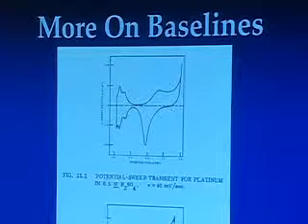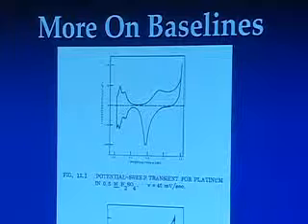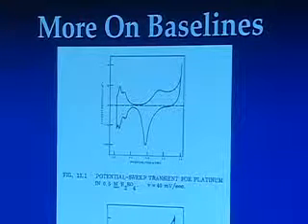But if you see a sharp peak that's asymmetric, 9 times out of 10, that's a stripping peak. That means you have some chemisorption on your electrode. There's something on there that is coming off when you do that. So if you don't expect that, if you don't want that to be happening, if you really have something out in solution, keep an eye out for that.